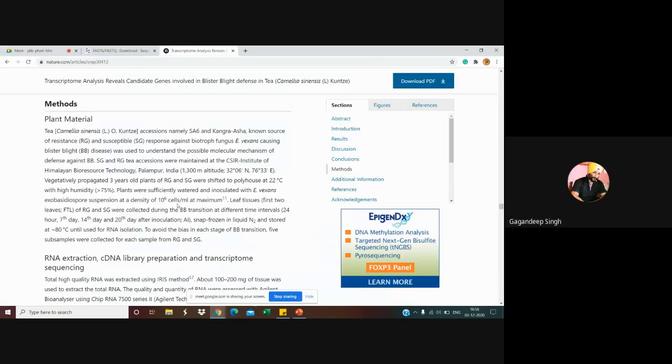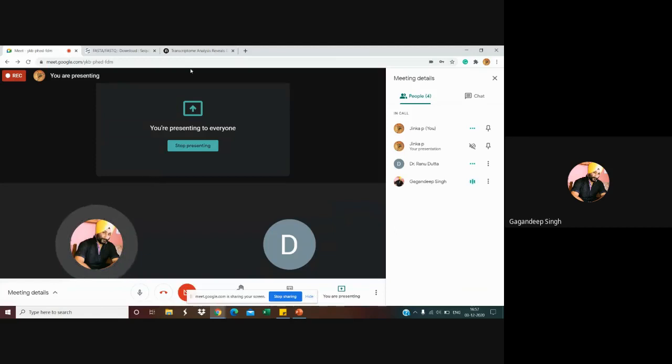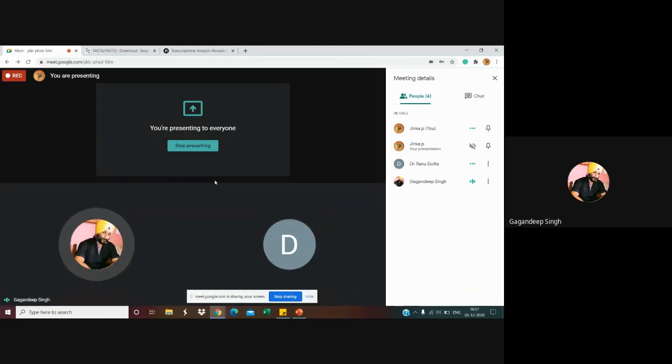But I think this may be more difficult for you if we are going from one to another. That's why today I want to just give an introduction. Then we'll download our data, which is available in the genome database, because we can't sequence data right now. We'll download our data.